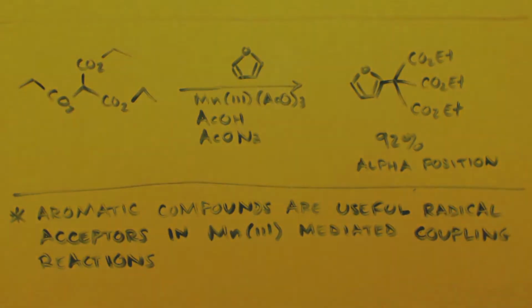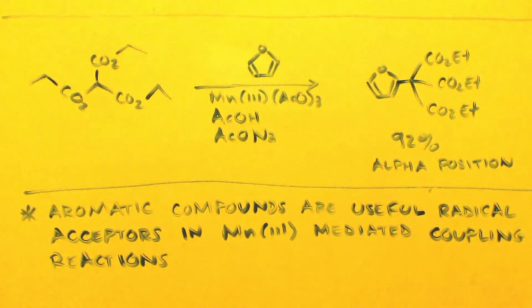So this is why I do believe that the reaction will work. Okay, I also wanted to bring something else up that is in Wikipedia. It says Mn3 acetate may be used either as its dihydrate or as anhydrous. So trying to get it anhydrous is no sense. It just sounds like extra work.